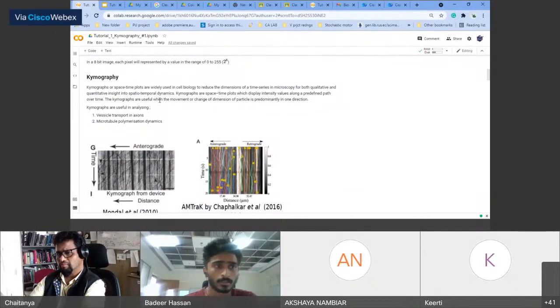In this first tutorial, I'll be talking about how to generate a kymography plot. So what is kymography?